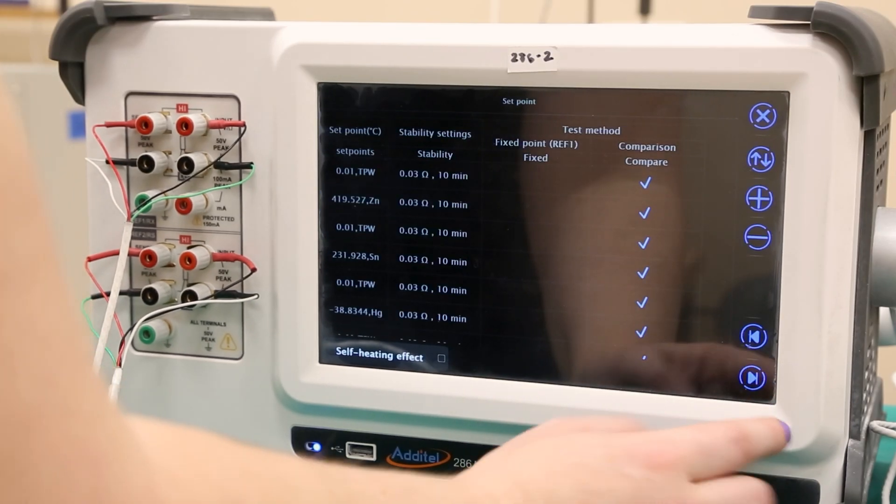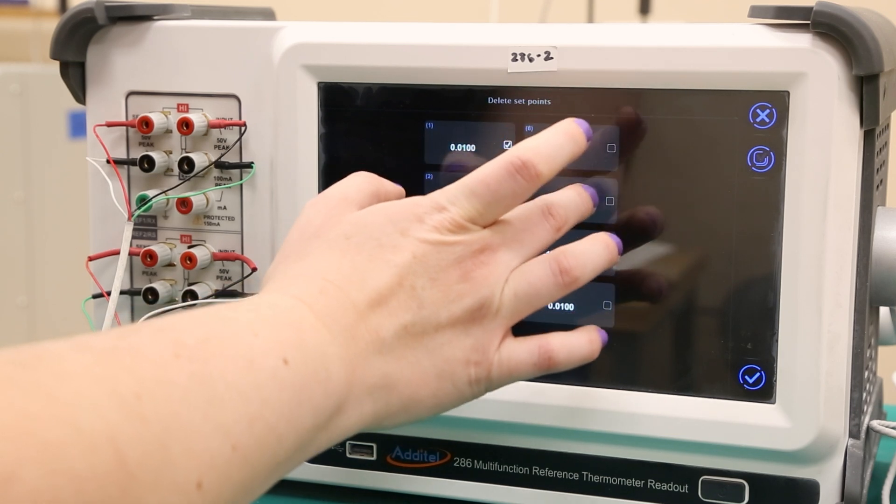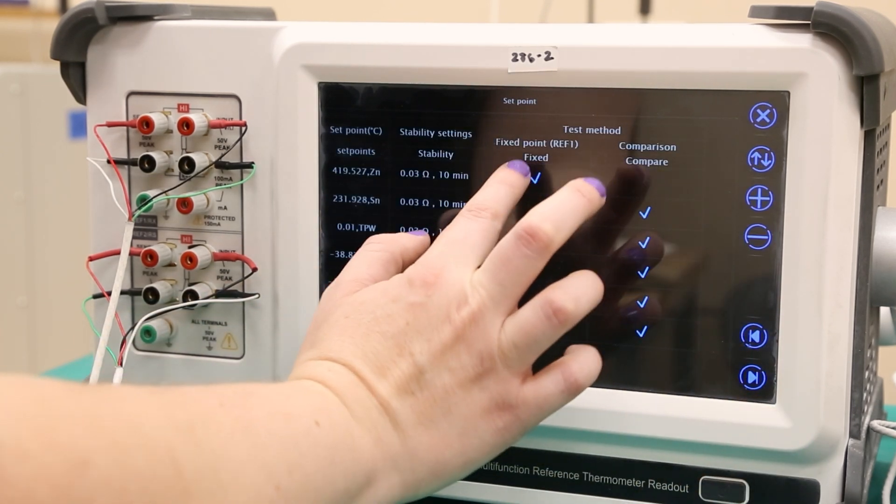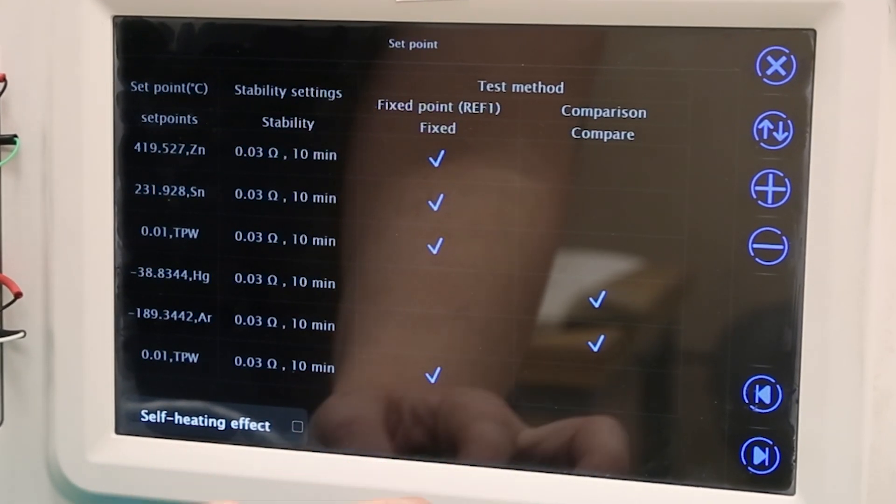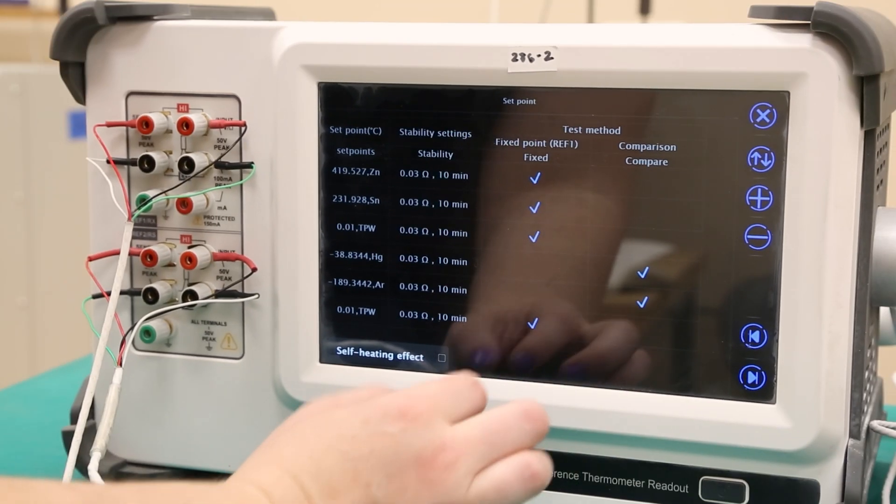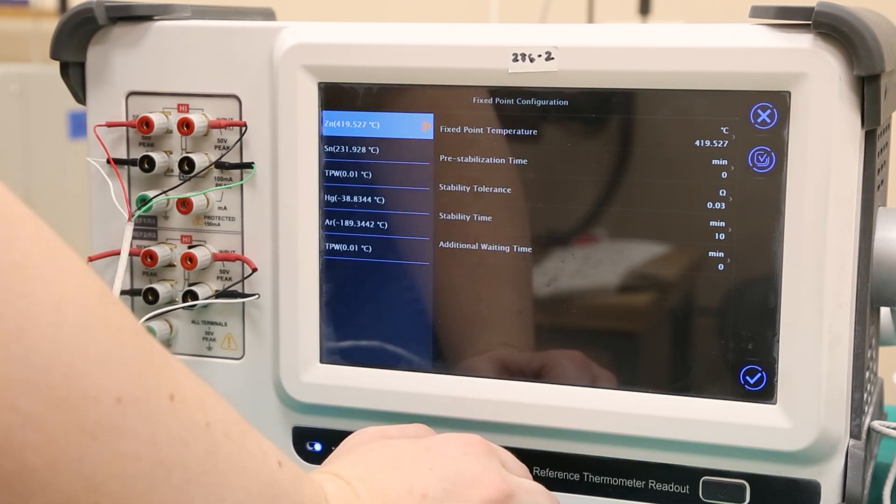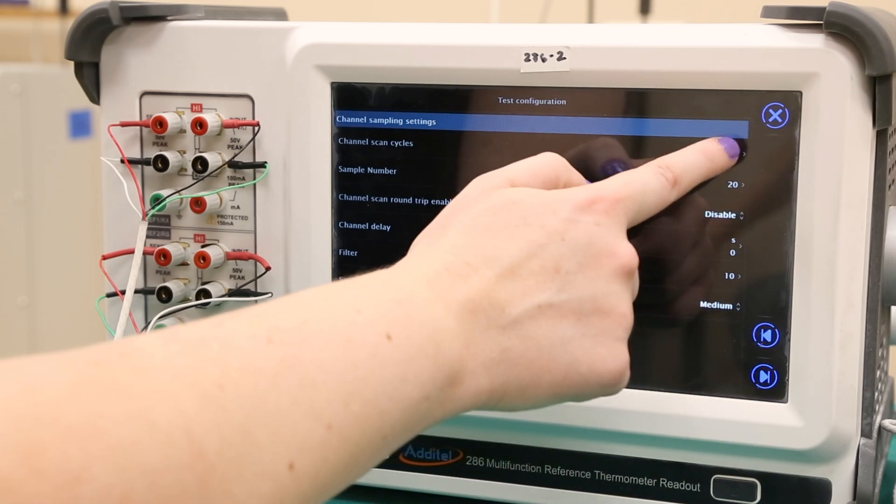Here the test method for each calibration point can be changed and points can be added or removed using the plus or minus keys. We will use fixed point tests for the zinc, tin, and water calibration points and comparison tests for the other two. Specific test settings can be changed here as well by selecting the calibration point you wish to change parameters for. Once each point is configured to your lab standards, press the next key.